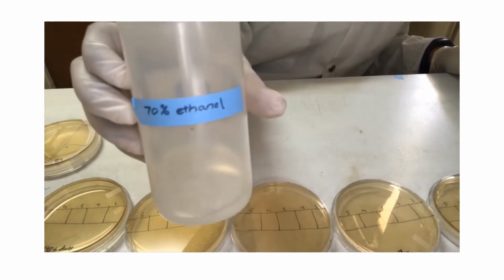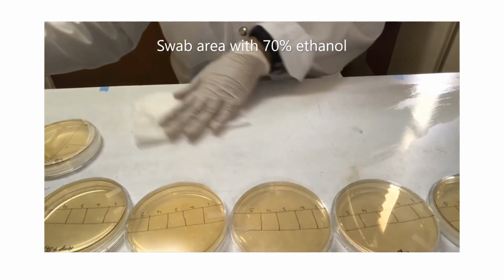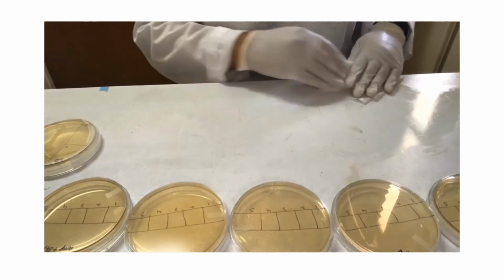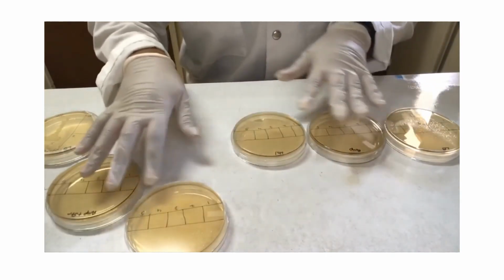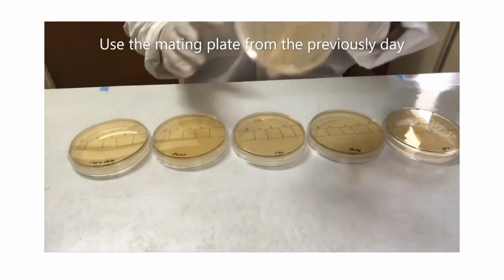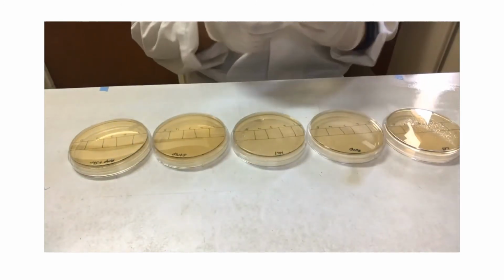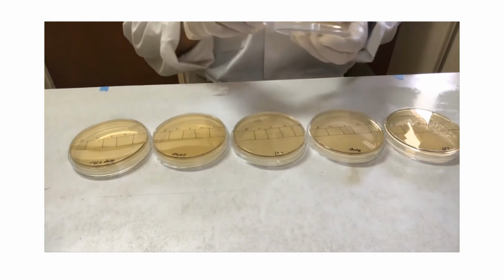Please observe how each of the plates have been divided into the 5 sections. 70% ethanol is used to sanitize the workspace. She then displays the mating plate from day 2. Note the growth of recombinant cells in region 3 of the plate.